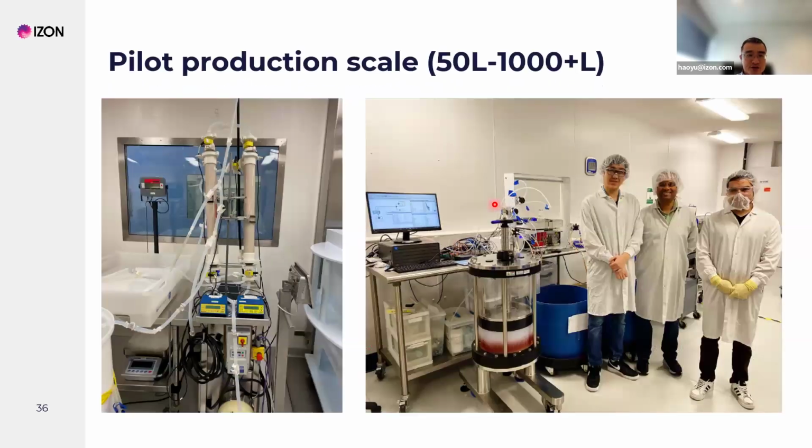As you see in the image, this is a large industry scale TFF system, and also the large QEV 2700 column, which can handle around 3 liters of cell culture medium. You can see the purple, the red color here is currently running concentrated samples.